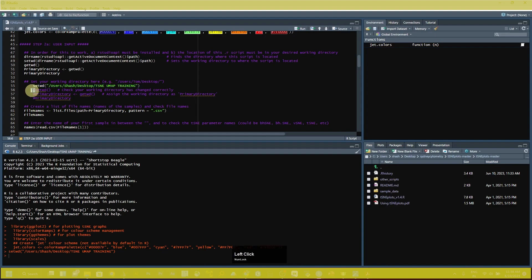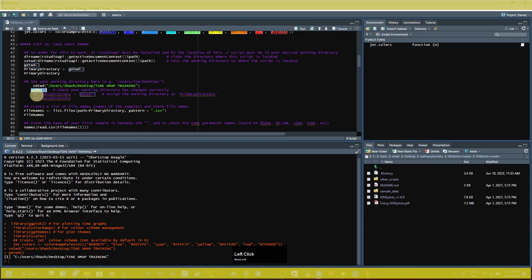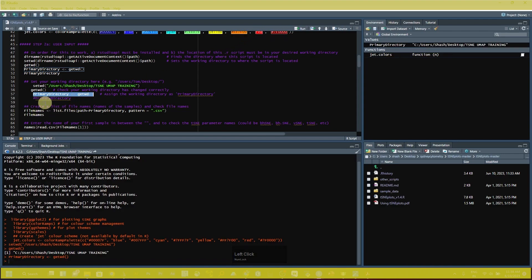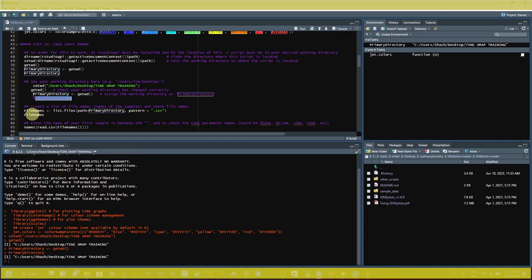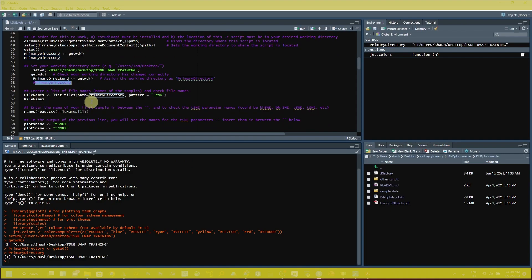After setting the working directory, run the following commands they have provided. Select them and click Run to get the working directory set as the primary directory. You can see all the commands are executed in the console and my folder 'training' is assigned as the primary directory.